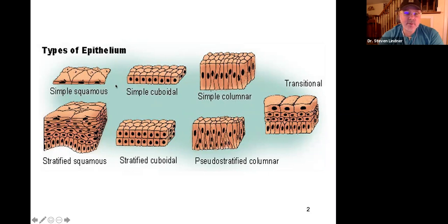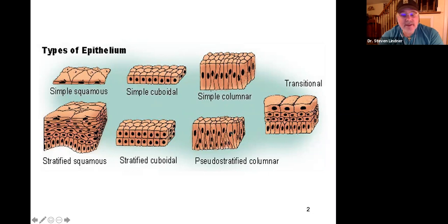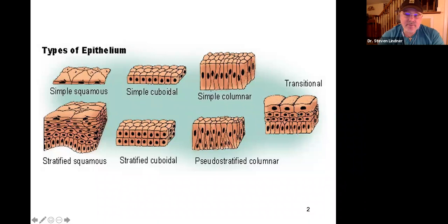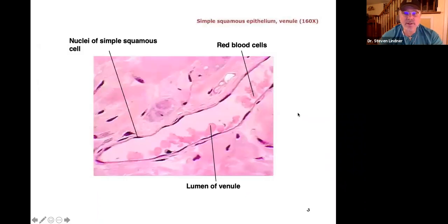You can have simple squamous, simple cuboidal, or simple columnar, or stratified squamous, stratified cuboidal. Remember, stratified columnar is typically pseudo-stratified — it looks stratified when it's really not. And then we have transitional epithelium, which is found around organs that can get bigger or smaller.